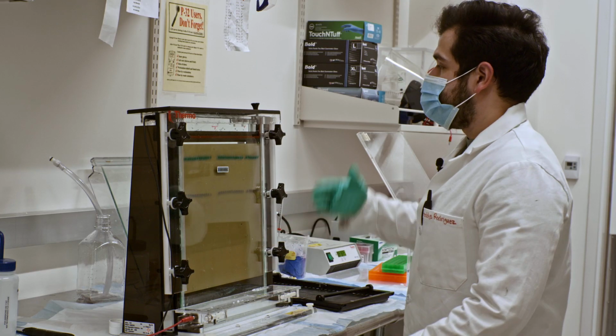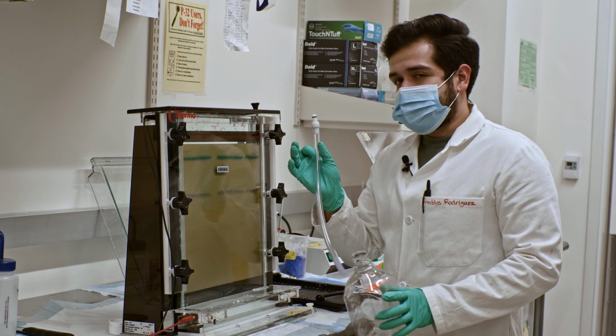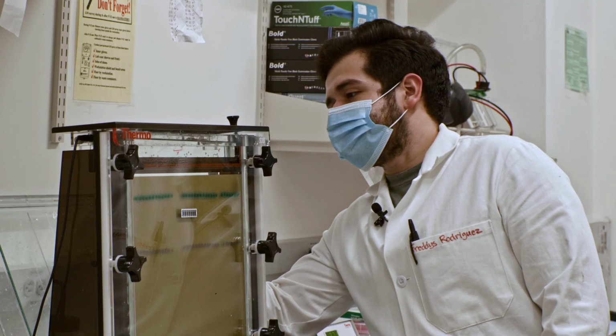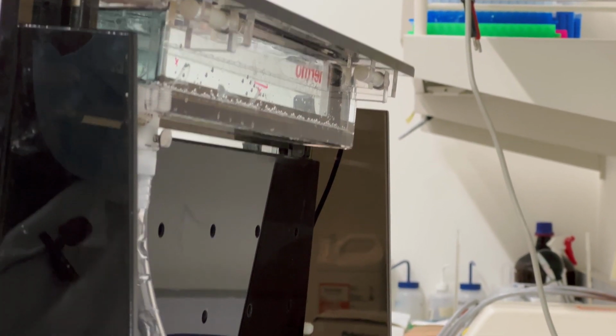First, we're going to drain out that top compartment of this gel box. It comes with a tubing which you can insert into a backing that's found here in order for it to drain out into this bottle. All you have to do is put the tubing in and you will hear a snap. Once you hear that snapping sound, you should see the TBE from the top compartment flowing into the container down below.